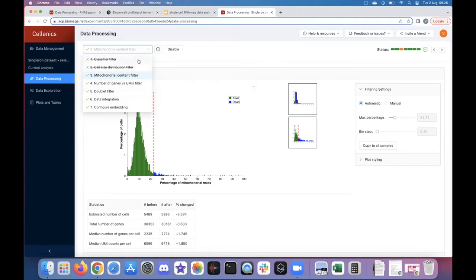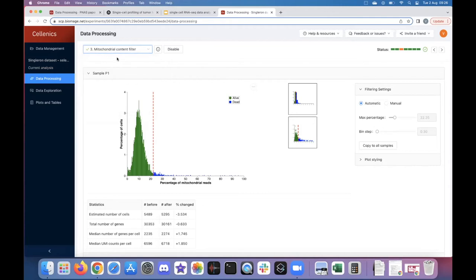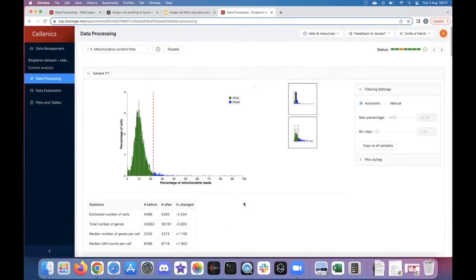The first two filters are already disabled in this case because I uploaded the Single Runs count matrices output from CellScope, which Anna just discussed. Selenix recognized that the empty wells had already been removed and disabled those filters accordingly. For datasets not pre-filtered — whether Single Runs or other technologies like 10x — those filters would be enabled. For today's demo I'll start on filter three: the mitochondrial content filter, where dead and dying cells can be removed. Samples are listed vertically and you can easily scroll through them, with a statistical table underneath each plot showing how many cells are being removed.